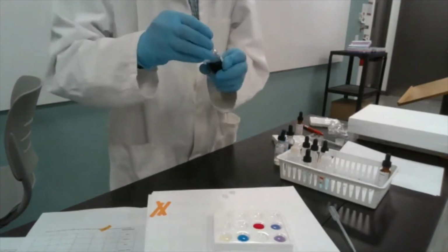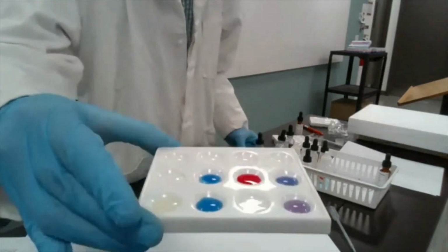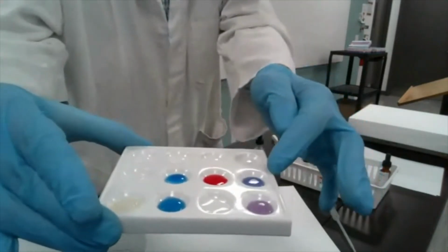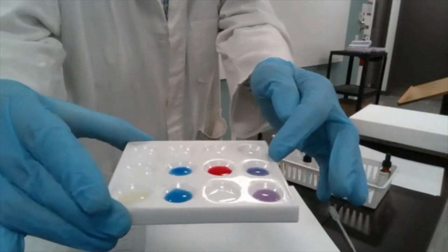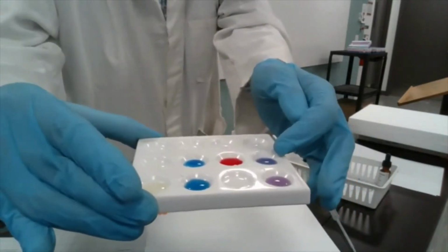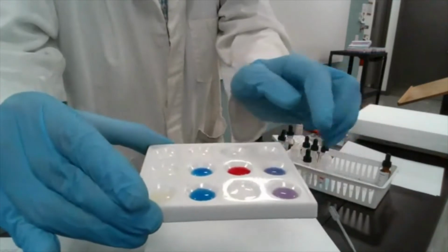Okay, that was quite a dramatic change there. Now let's look at this again. So that second row of wells, this is what we're looking at. So this one. So we have blue again for bromothymol blue. You can ignore the slight differences here. This appears as more purple in distilled water, and this appears as quite blue. You can still write blue because we don't really use gradations for this indicator of color.